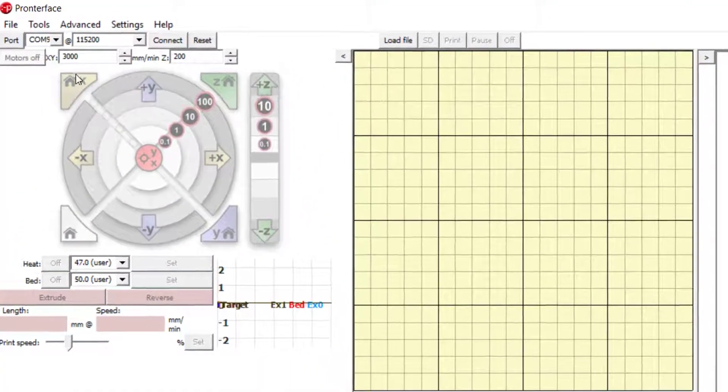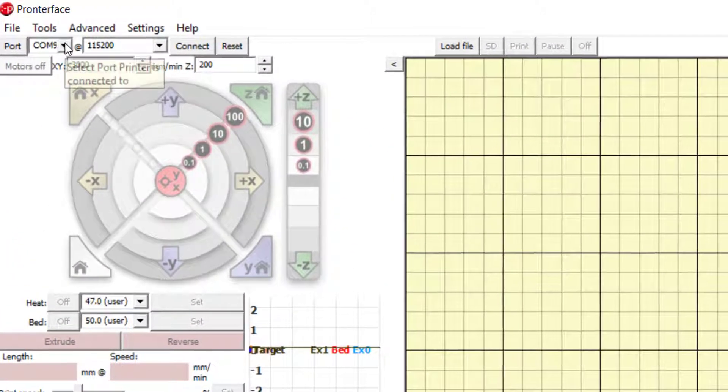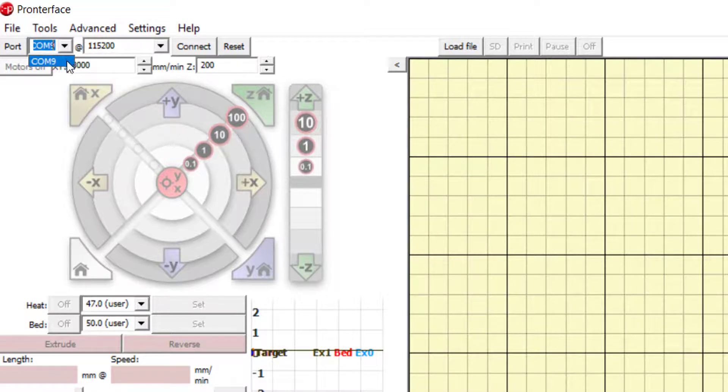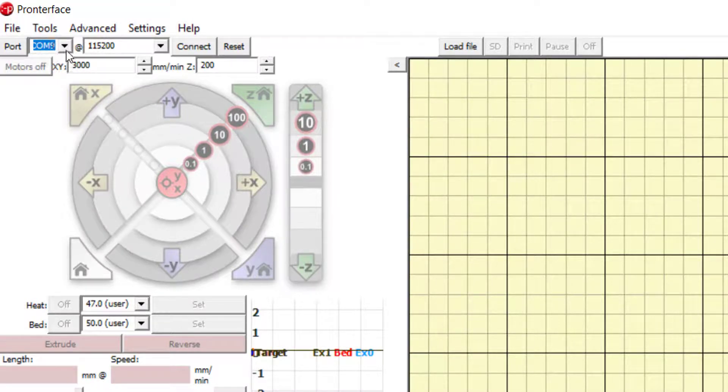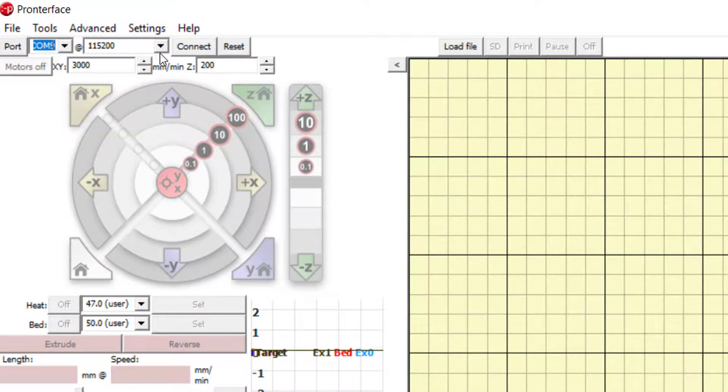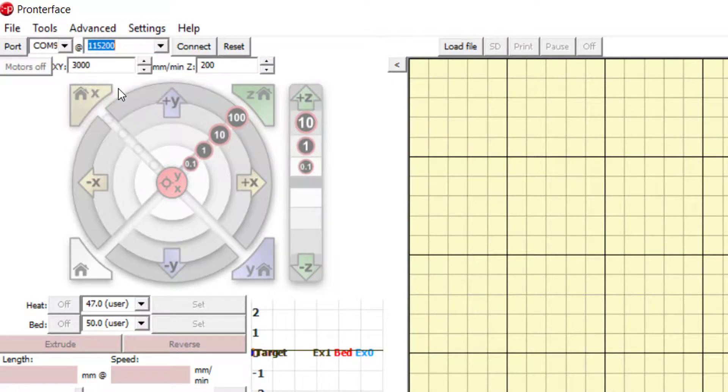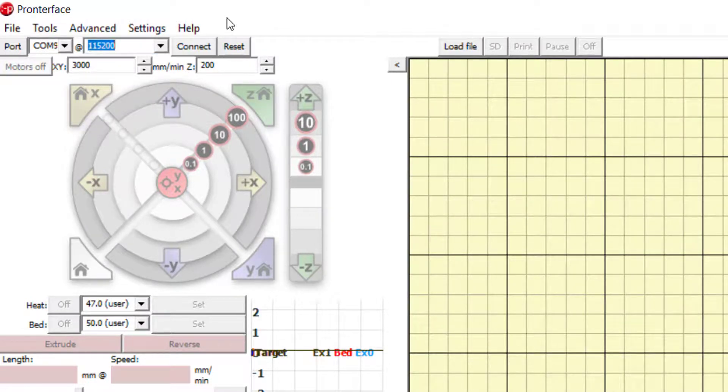Make sure that the bioprinter is connected to your computer with a USB cable. Then in the port dropdown menu, choose the proper port. Also ensure that the baud rate dropdown menu next to the port menu is set to 115200.